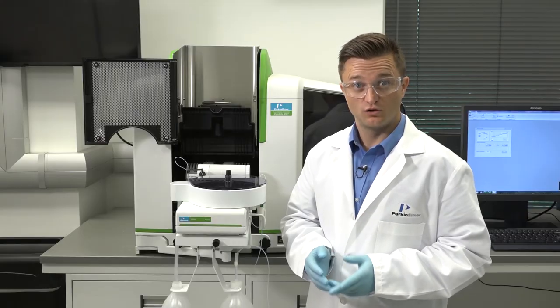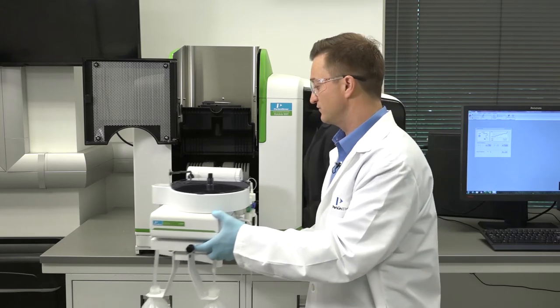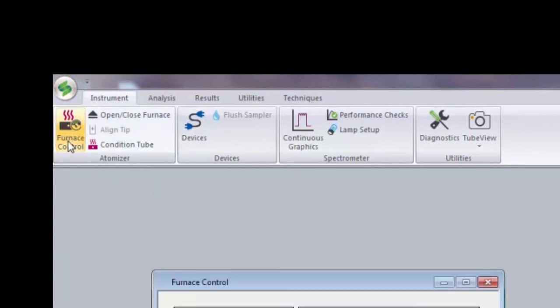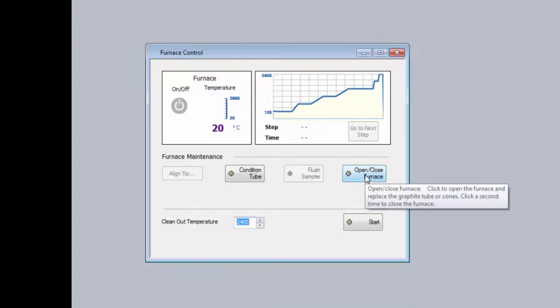Once the furnace is cool, unlatch the auto sampler and swivel it out of the way. First go to the instrument tab, then atomizer group and click on the furnace control. The furnace control window will appear. In the furnace control window click on the open close button.